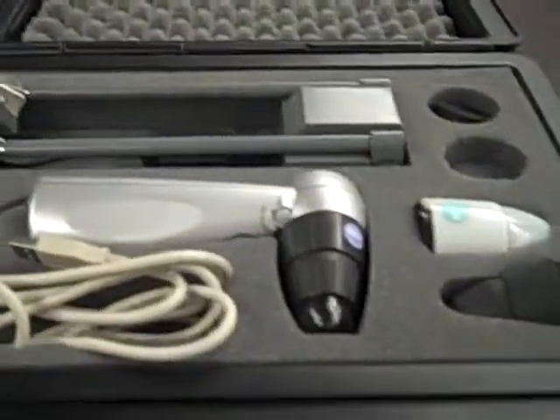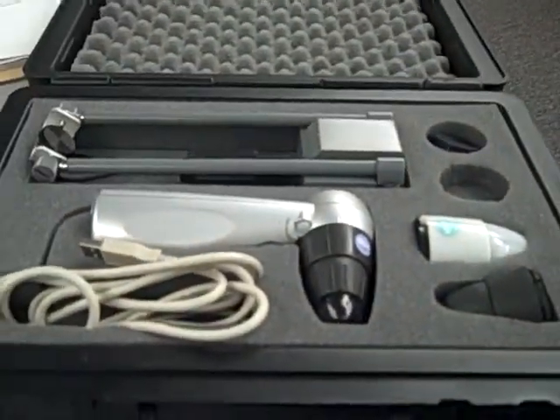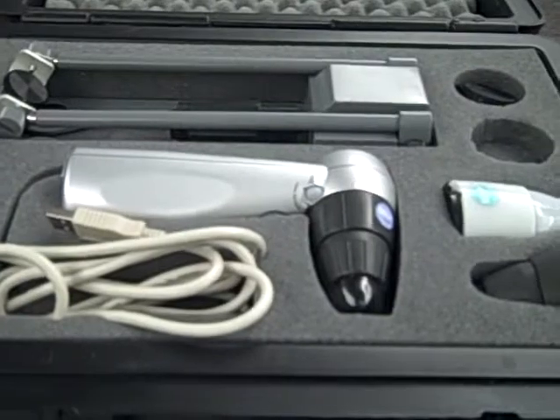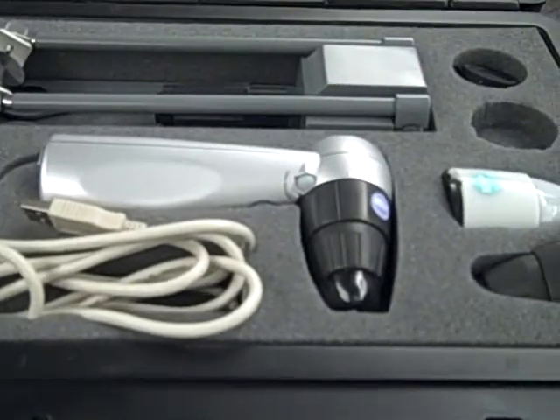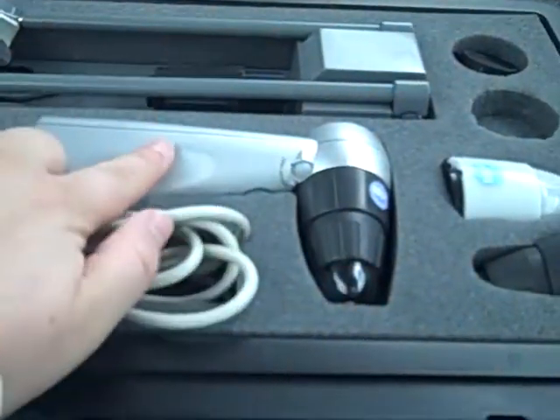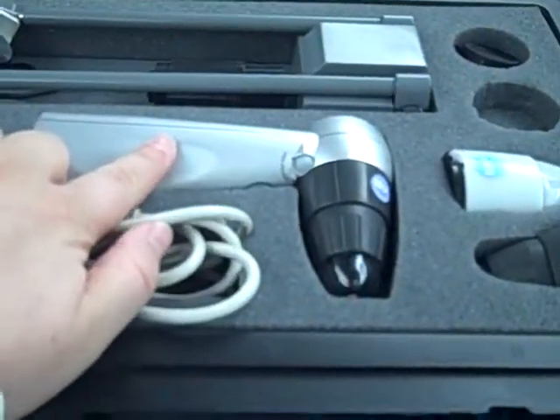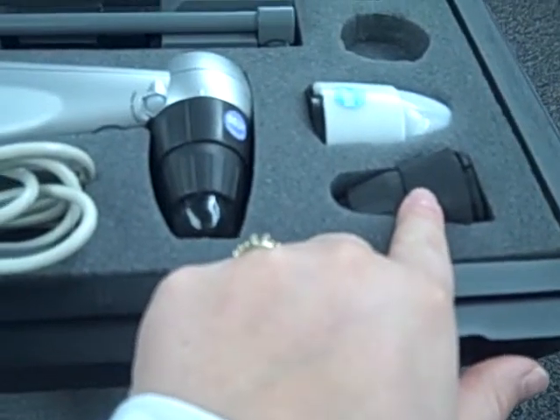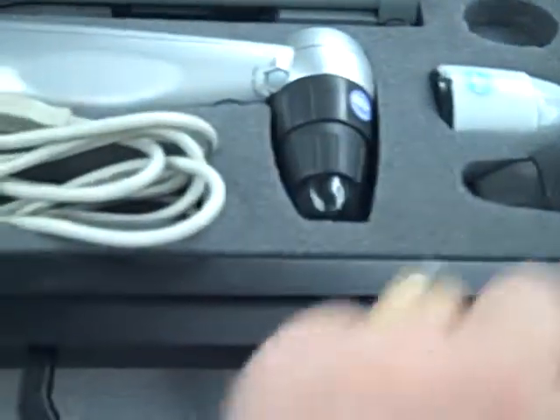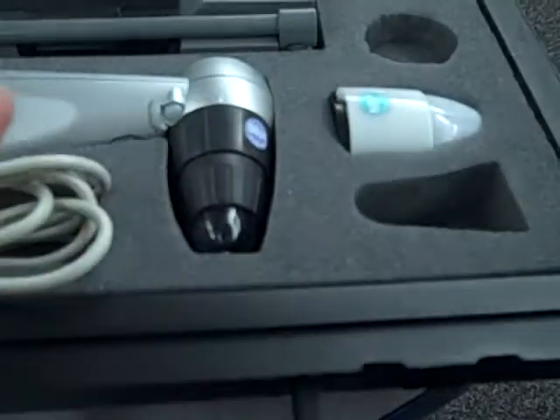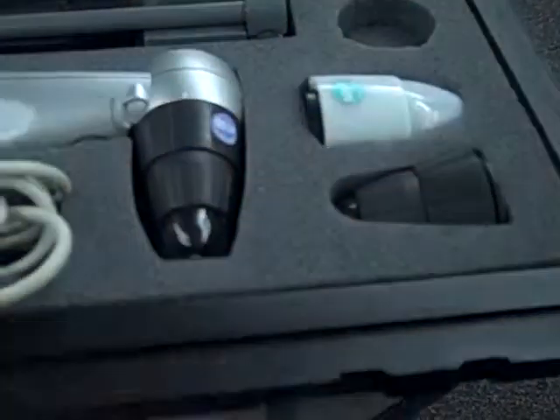Inside the box with the microscope comes items that look like this. The ones you're probably going to want to use the most are the microscope itself and the lens attachments. We have found that the 400 attachment, 400 times, is just a little too powerful for what we use. So we like to use the 100 zoom, which is right here.